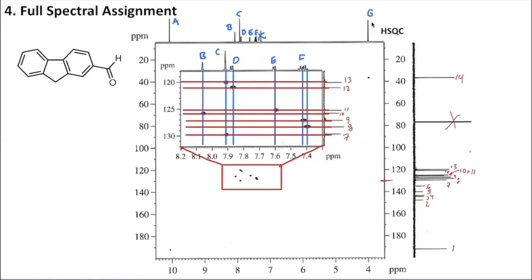Okay, it's really looking like plaid now, isn't it? It looks okay to me, even though 10 and 11 are very close together still. I think we're able to resolve them with this level of zoom. So let's go ahead and label these correlations with a letter number combination, and then we can get rid of this plaid because it's a lot to look at.